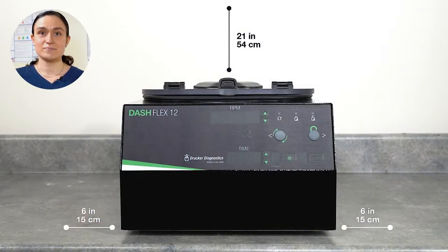Now let's put our centrifuge on a flat, sturdy surface. Make sure that you have at least 6 inches or 15 centimeters of clearance on either side, and 21 inches or 54 centimeters of clearance above so that you can open the centrifuge.